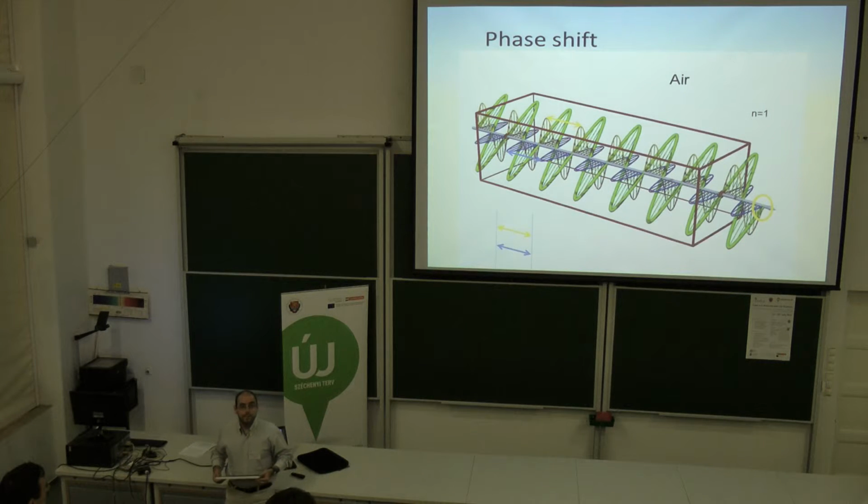The coordinate system was at 45 degrees to the original polarization plate, so all the time we have to consider this 45 degrees to put the modulator in a diagonal position to the original coordinate system. What we would like to use for imaging, what kind of rays we would like to use for the vertical and horizontal components of the dipoles during the imaging.